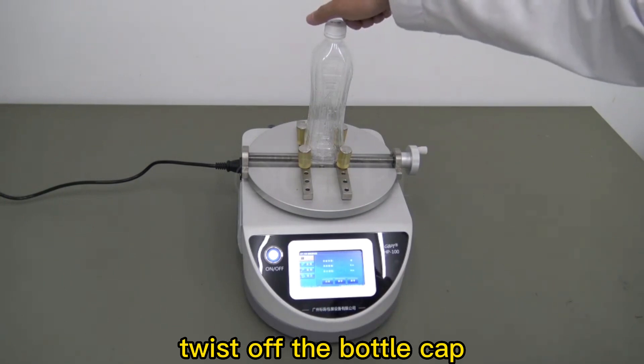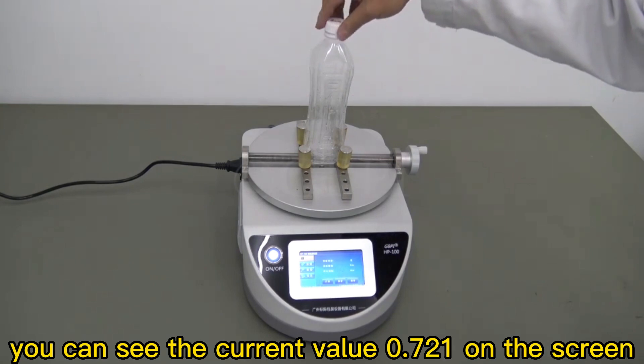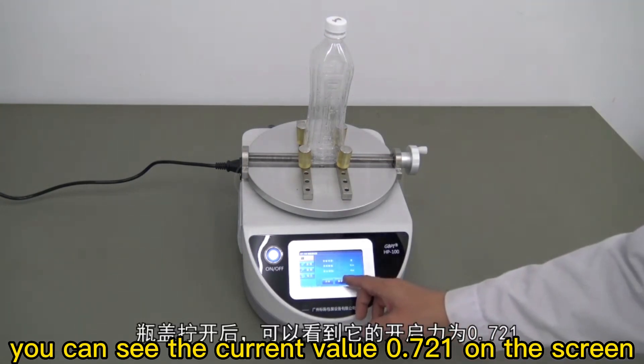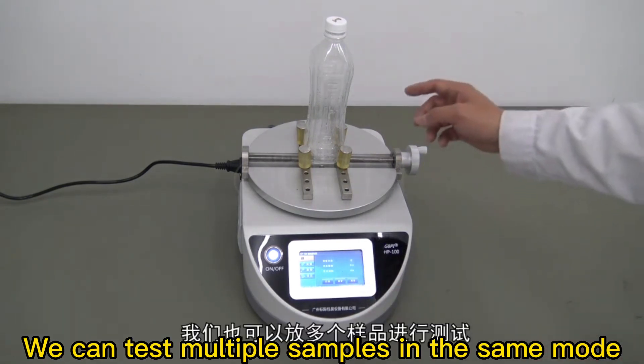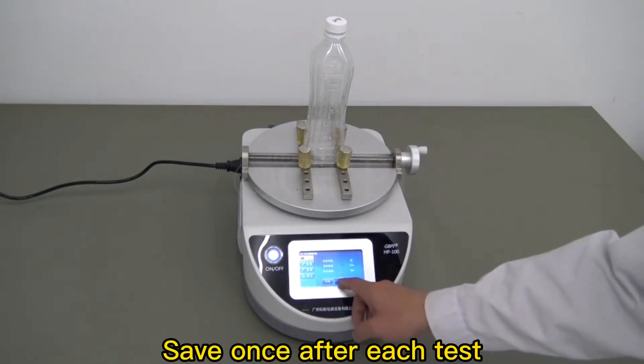Twist off the bottle cap. You can see the current value 0.721 on the screen. We can test multiple samples in the same mode. Save once after each test.